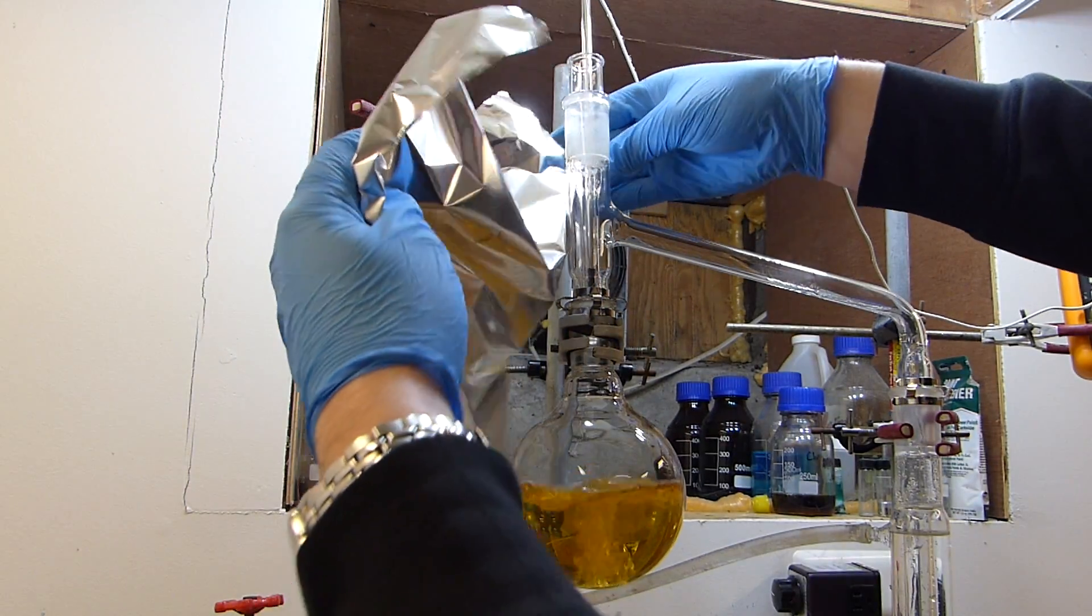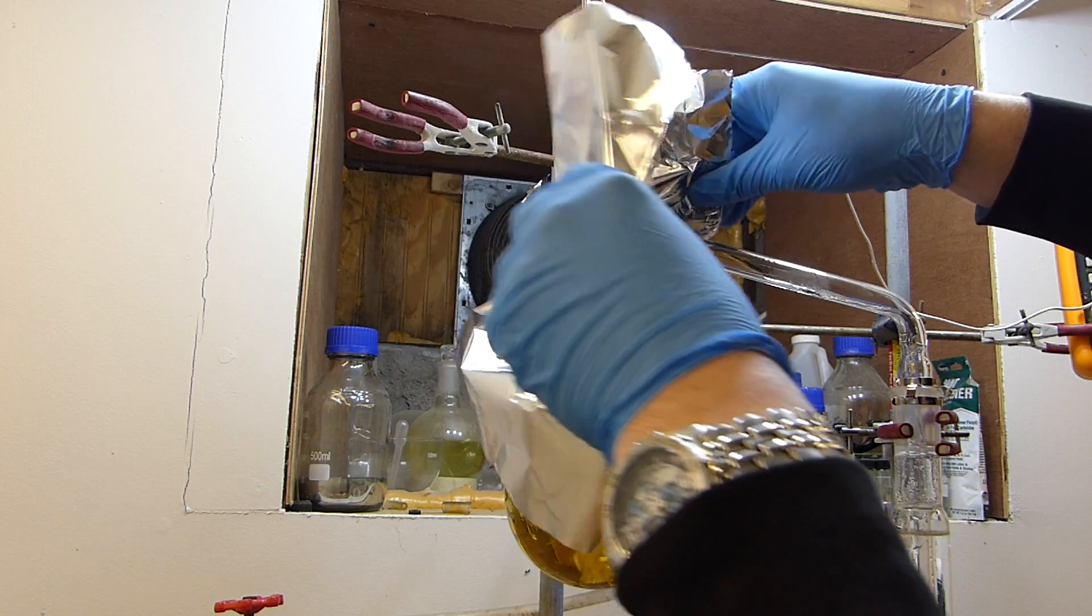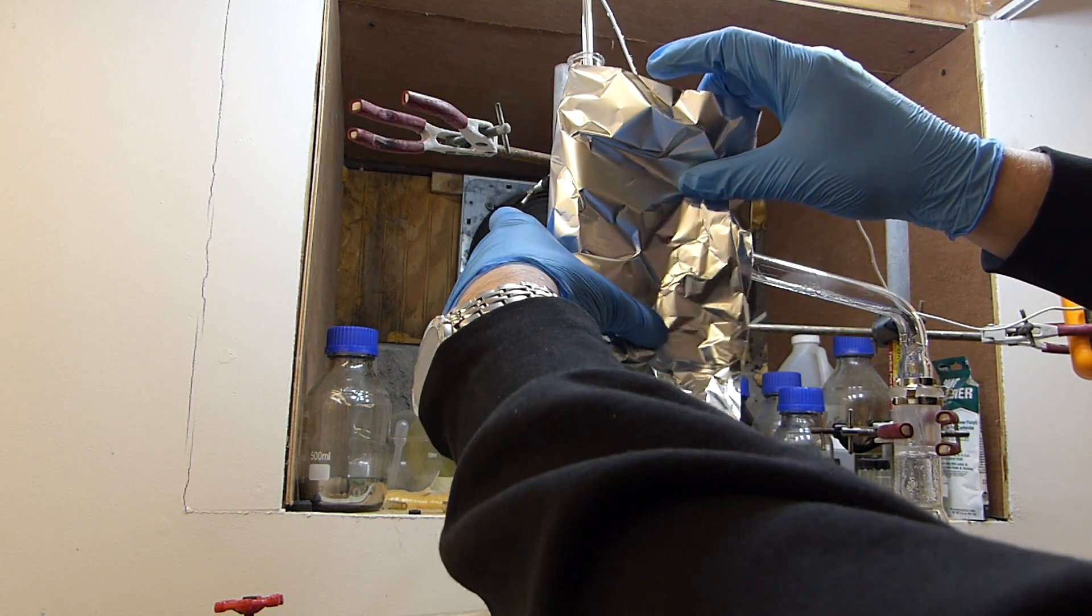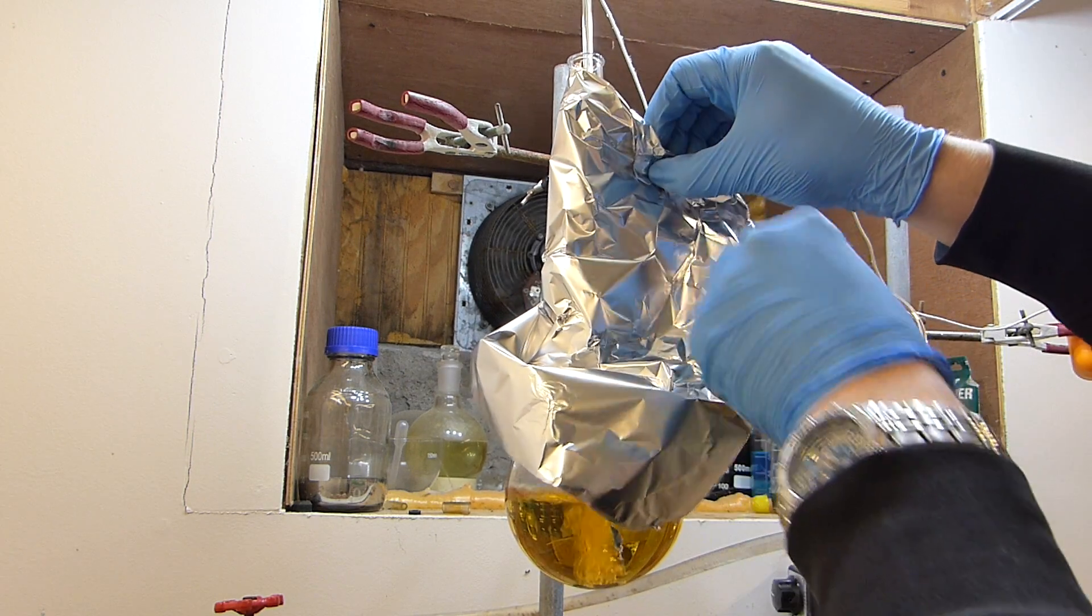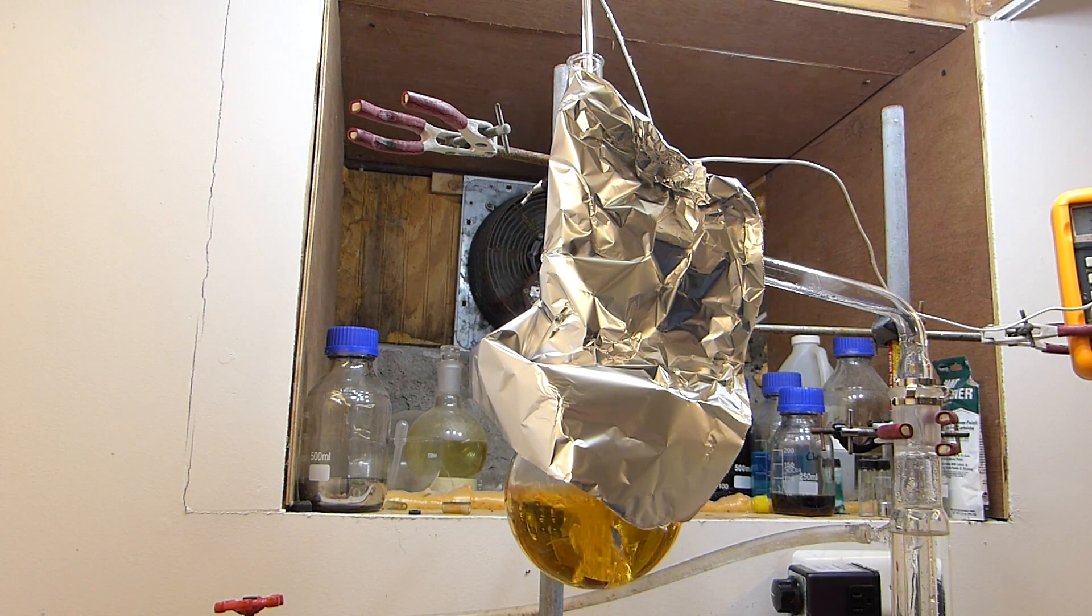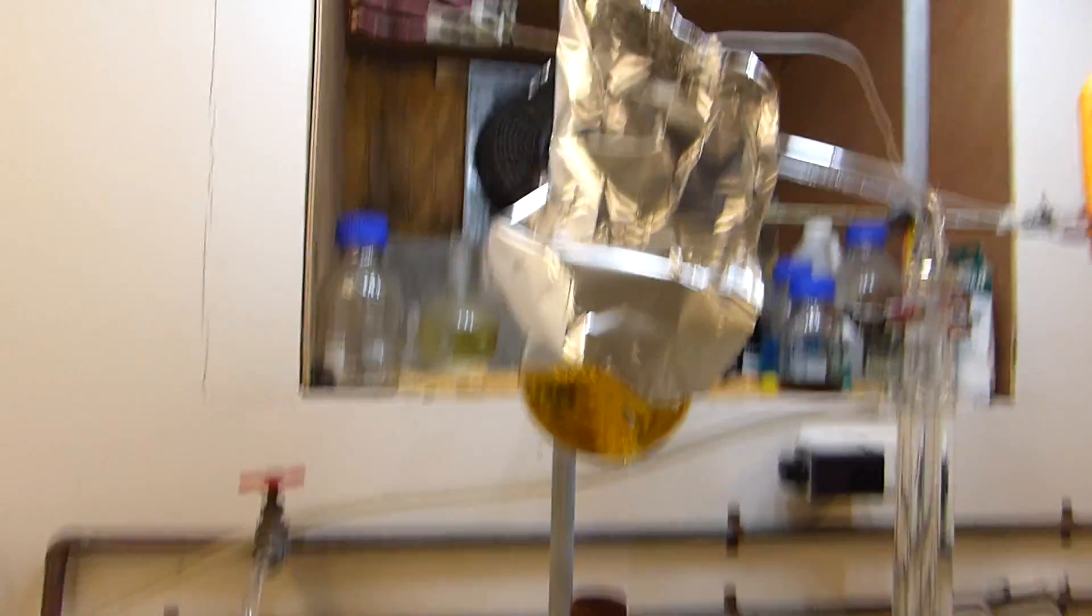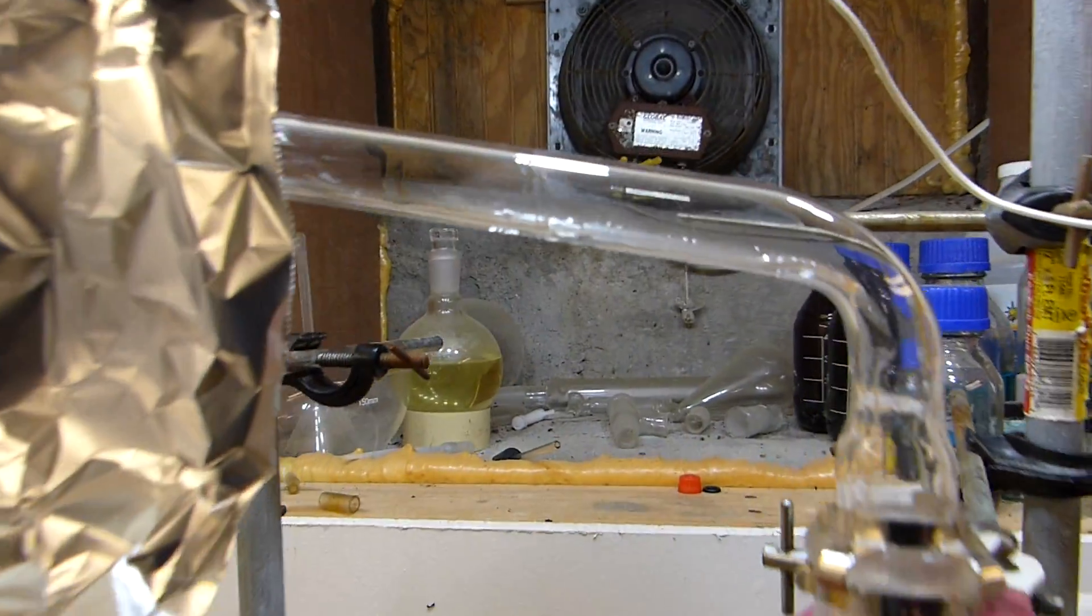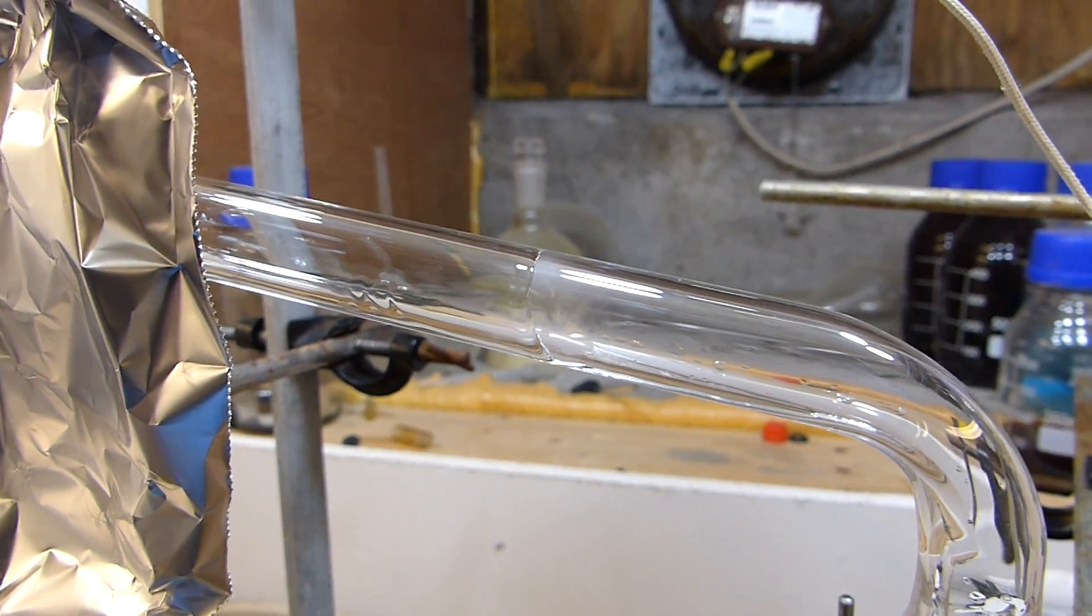So this foil is going to help keep this still head hot and prevent a lot of the reflux back into the flask that we're seeing here. Let's push this together nice and toasty. Perfect, that should really increase the rate at which we're taking acid off, and you can already see right there the syrupy acid coming over. I don't want to touch that obviously, that's 600 degrees.